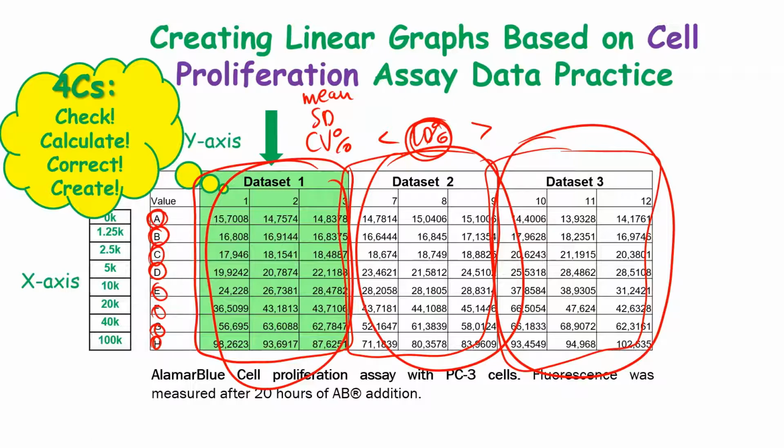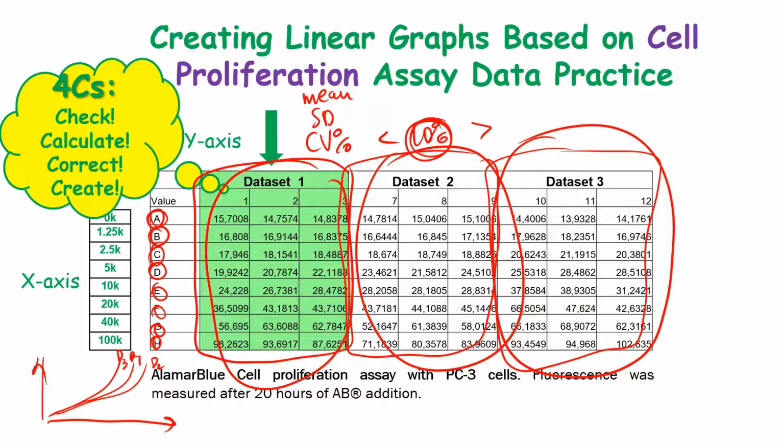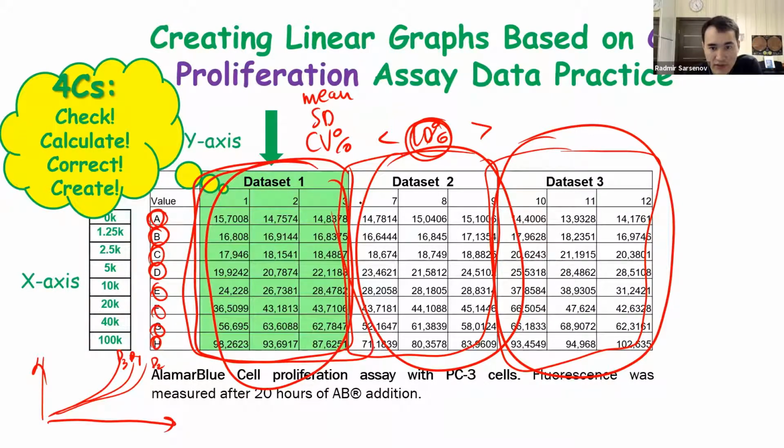But when we plot the graph, what values should we use, like mean values? So let's do it like this. Again, in your graph, you will have 3 different linear plots, and one goes for dataset 1, dataset 2, and dataset 3. Okay? Is it clear, Ali? Not so much. Okay, so just build a plot for every dataset you have.